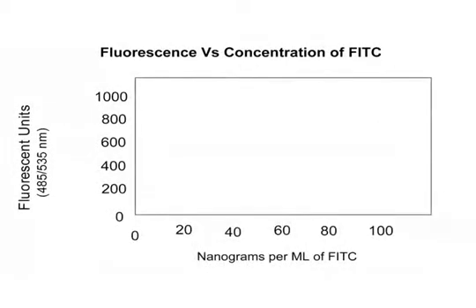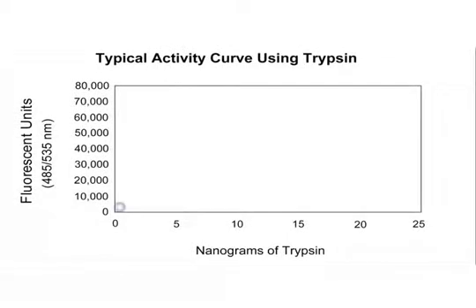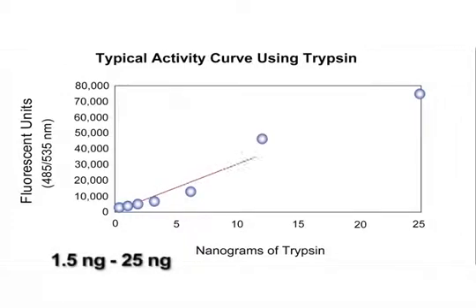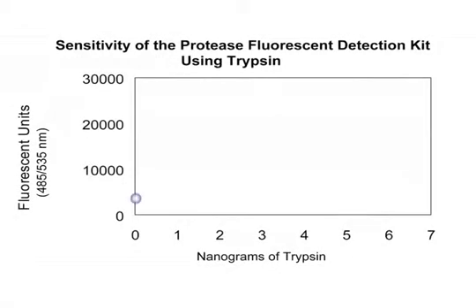In this assay, fluorescein isothiocyanate is provided as a control for possible instrument calibration. Shown here is a representative linearity range of the FITC signal. Following the described procedure using this kit, with an incubation time of 30 minutes for the first incubation step, yields this typical standard curve for trypsin and control samples, ranging from 1.5 nanograms to 25 nanograms. Fluorescence measurements were made in a multi-well plate. The limit of detection of the assay is the amount of protease that produces a significant fluorescence reading above the value obtained with the blank sample.